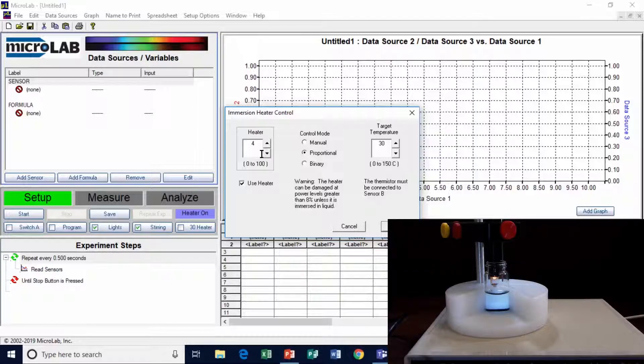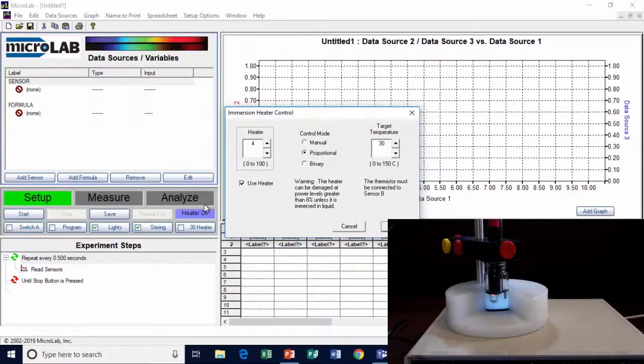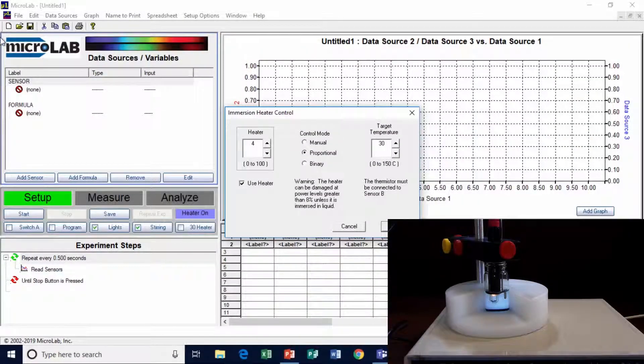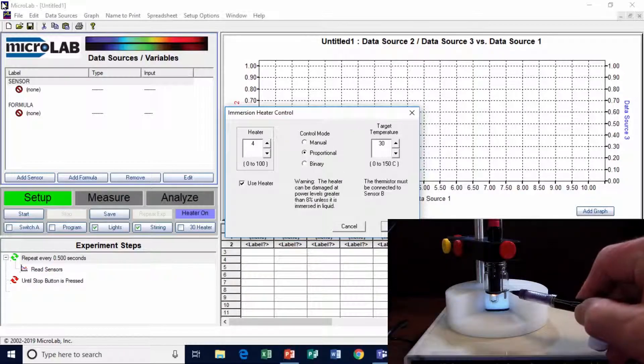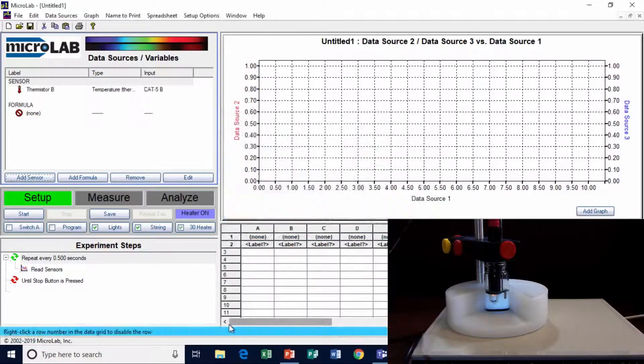Okay, I'm going to lower it down into the liquid. I'm going to turn it off to do that. You can see the light bulb lighting. You can see right beside it, right here, the thermistor that's going to monitor what's going on.